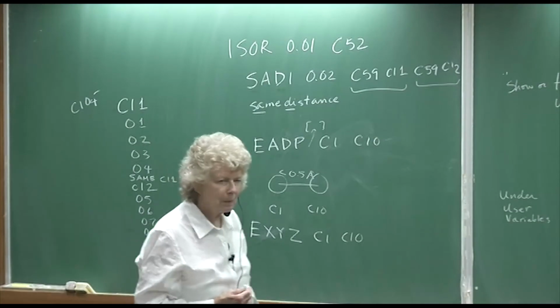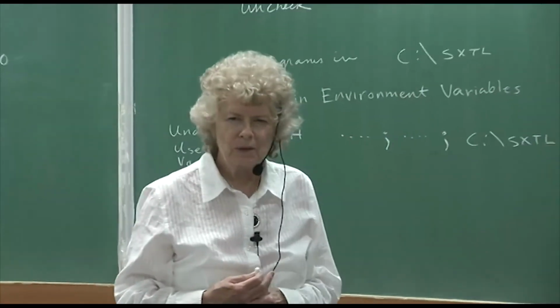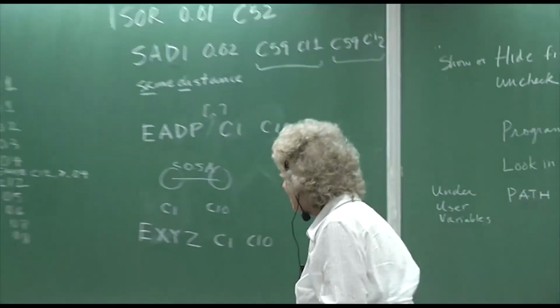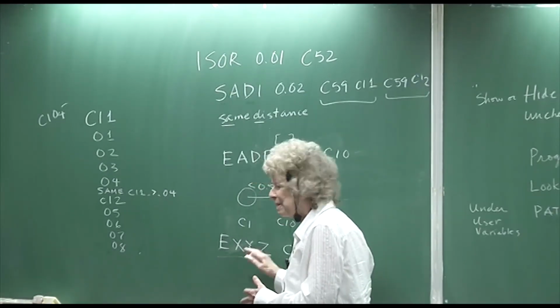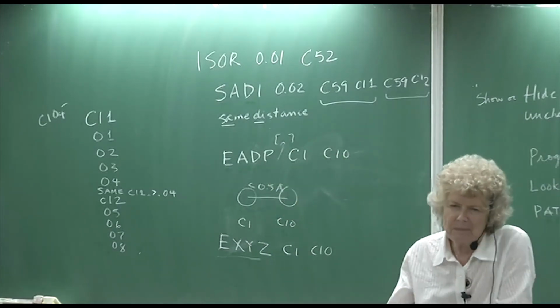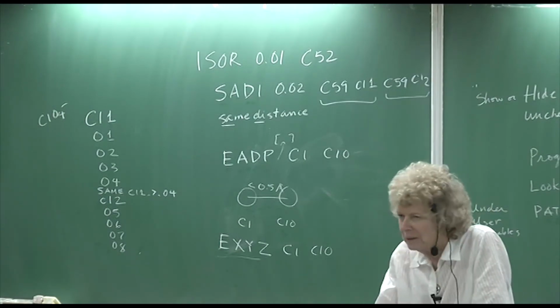So have a look at that PDF that I gave you that is now uploaded. It's so useful for remembering what these different commands mean. Fortunately, they often have a mnemonic. You can kind of guess what they mean, like EXYZ, equal XYZ. So it's not too hard to remember them. But there are quite a few, it's true.